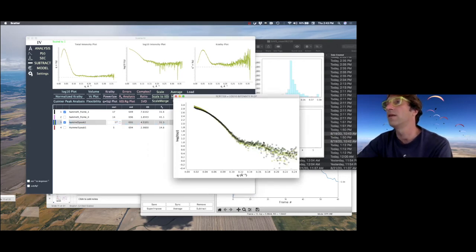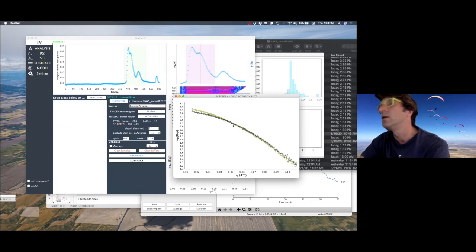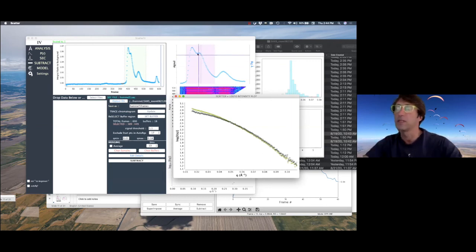Let's look at it, there is a significant difference in peak 2, because peak 2 is obviously affected by overlap with the larger particle. That's why this difference, which you see especially here, is due to the larger particle overcoming the smaller particle in the second peak. And so sometimes this EFA analysis really helps you to deconvolute, especially peaks under multiple or split peaks.